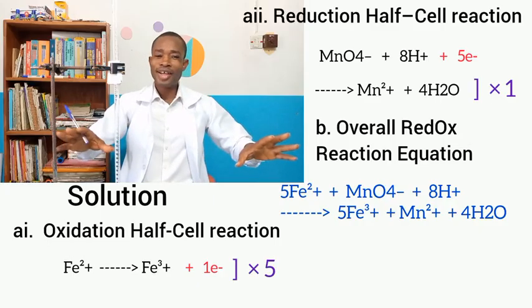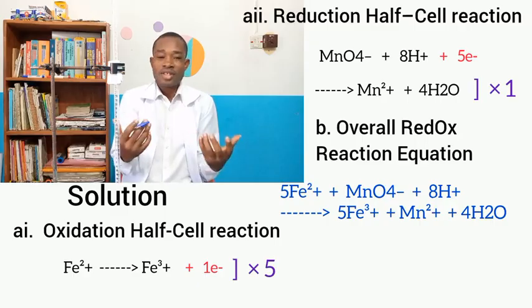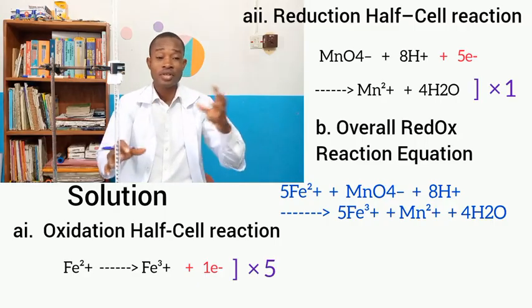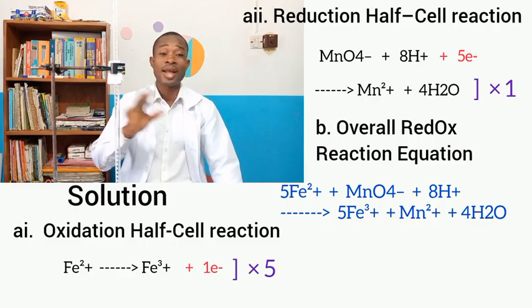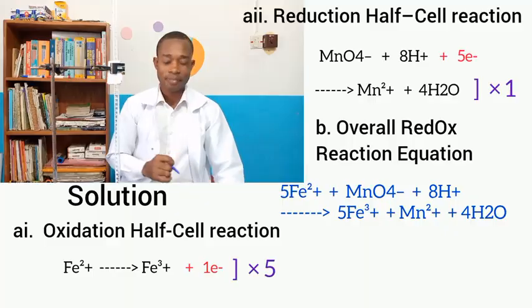Although, I had to take my time to explain this whole concept so that students that might have challenges with this redox titration process and how to balance the ionic equation can get some good concept from it.